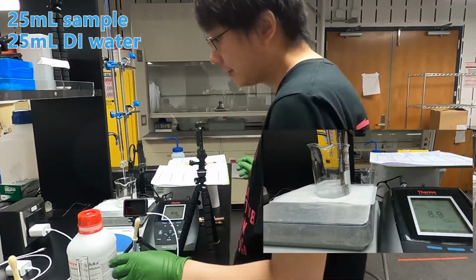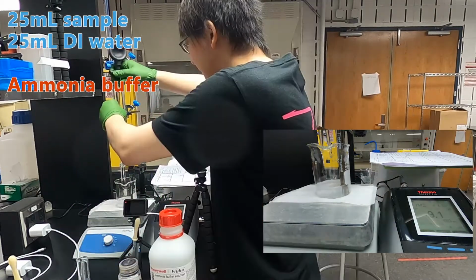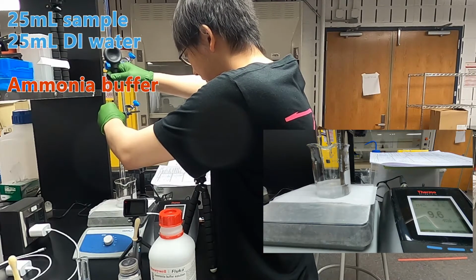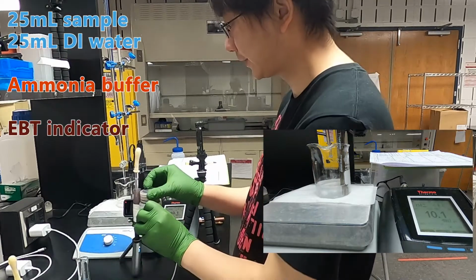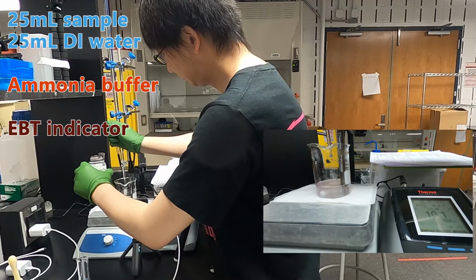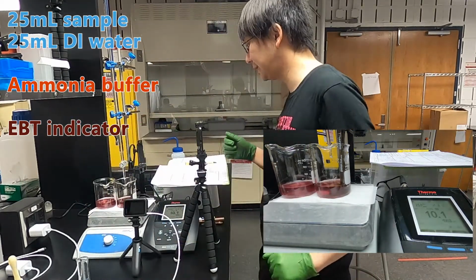And then we add ammonium buffer to the solution. And then we add EBT. Next, we titrate with EDTA.